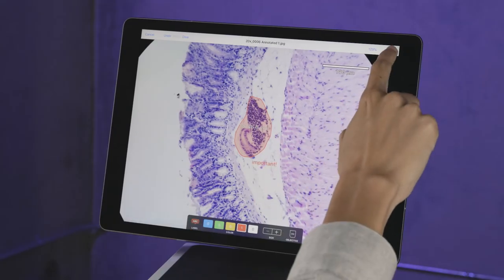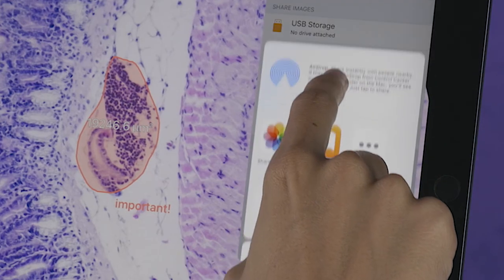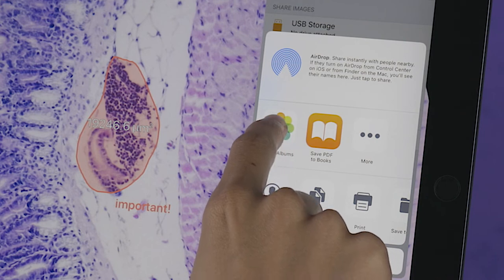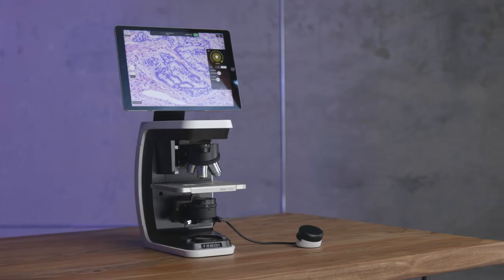REBEL offers multiple ways to share your data. You can export via USB and Ethernet ports, or because we're using an iPad, AirDrop and cloud-based applications such as Dropbox are also available. REBEL enables you to capture and share images in seconds.